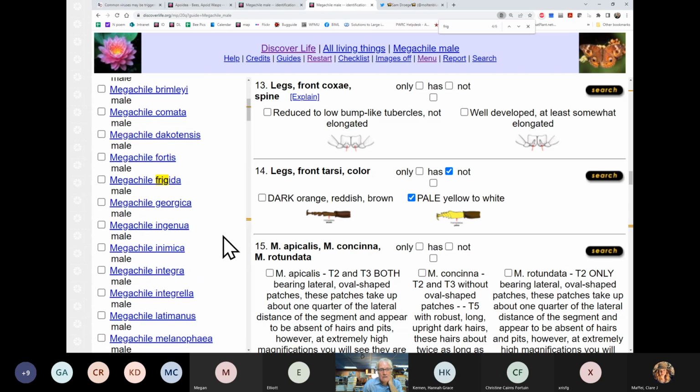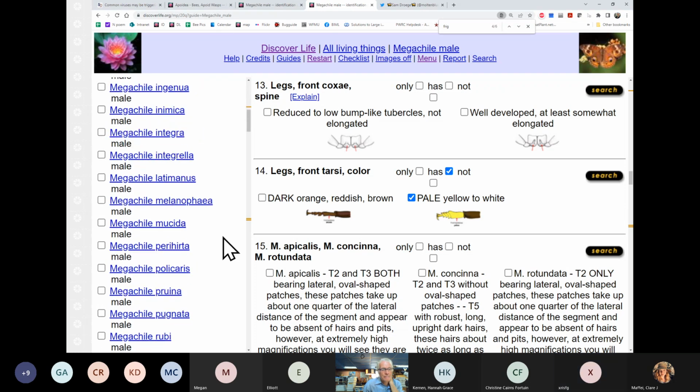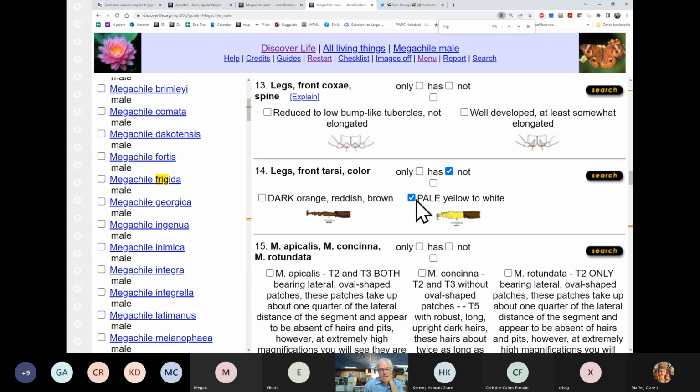And oh, maybe it's not scored there for both. I would have thought it was scored for both. Okay, anyway, maybe it was the other one. Now I want to go back and look at Exilus. So it says it was dark. Oops, where are my specimens? There we go. Maybe it was its counterpart. Or maybe I just need to score it for being pale too. Right, we're going back in.